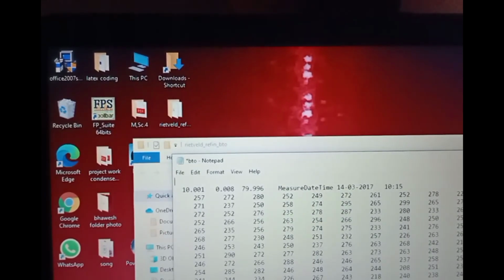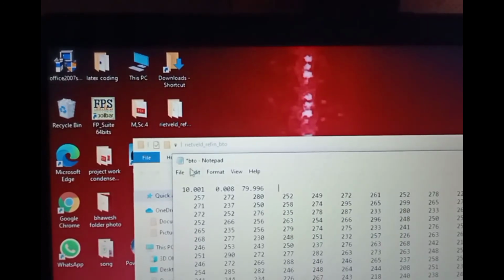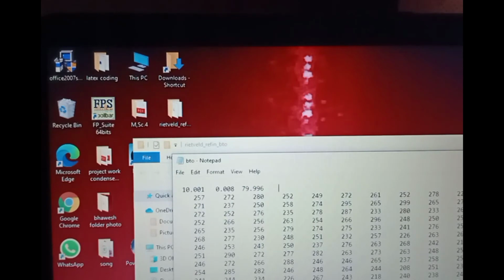Okay, now we have deleted this and added the extra. Now file and save. Now close it. Okay, now move on to our third round.